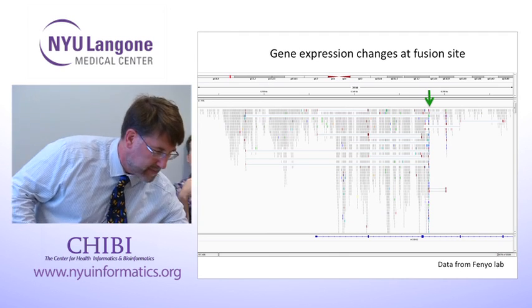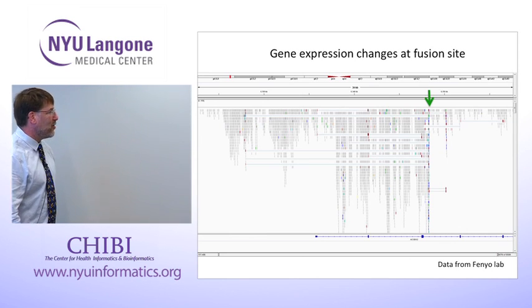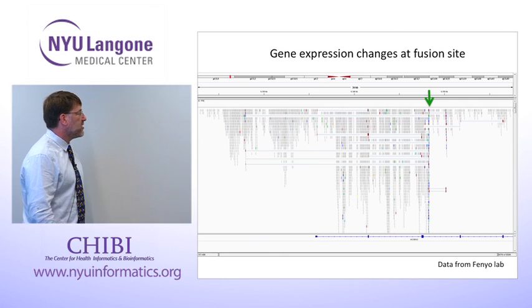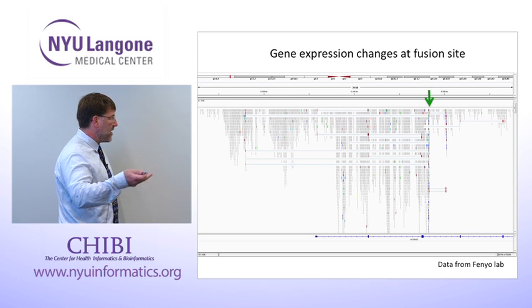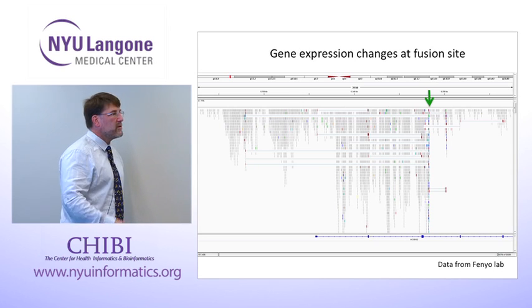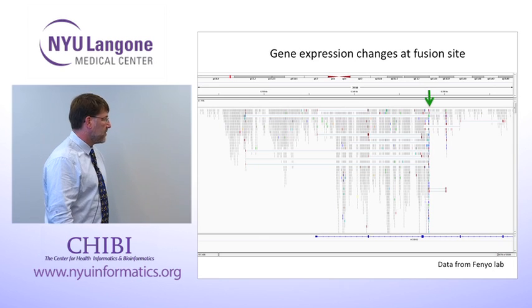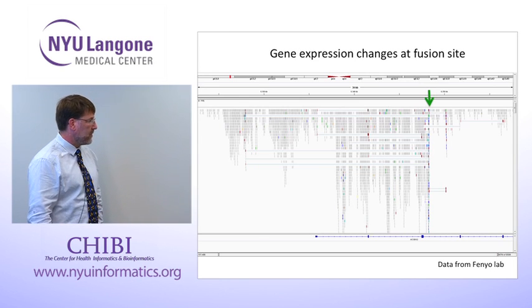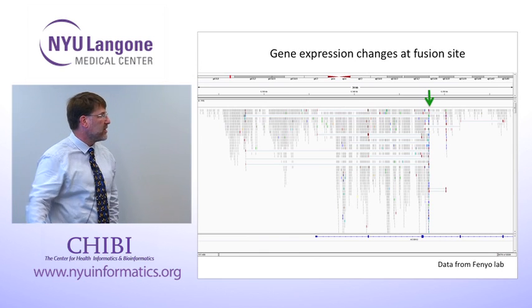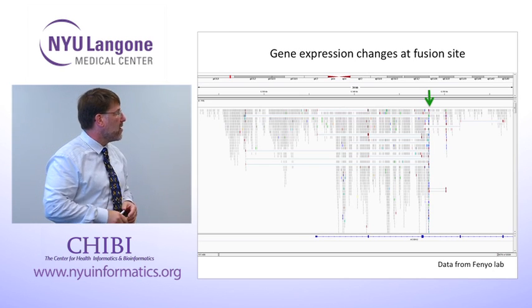Do we know of any normal events that happen, just to do this? Out of curiosity. I don't know of any. Without any relation to cancer. I mean, fusions that are not related to cancer, sure. Yeah, they're called translocations. They happen at some frequency in every genome. But these would be somatic translocations. Here you presented something which is on the level of transcript. But you would go back and validate this on the genome of the tumor cells that these transcripts came from, to see that you actually had a genomic fragment that spanned those two chromosomes.